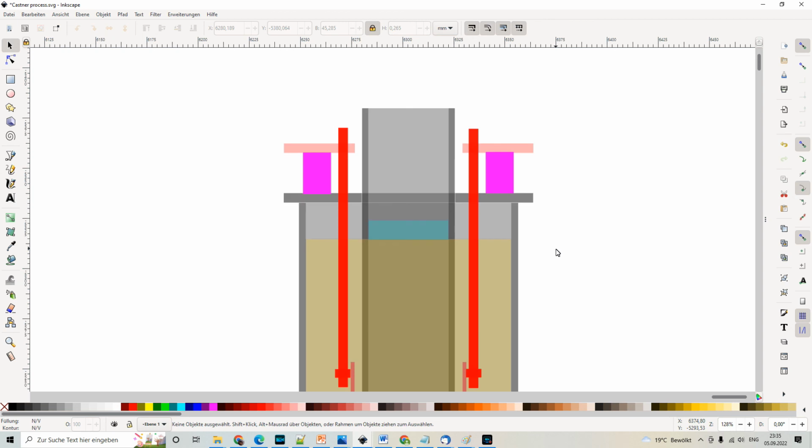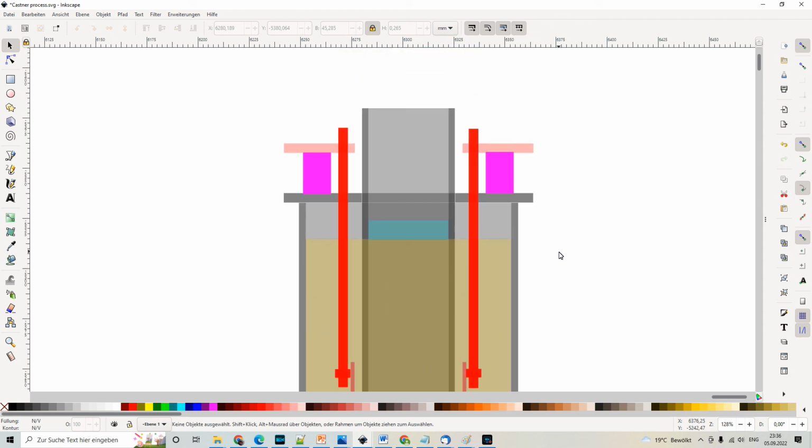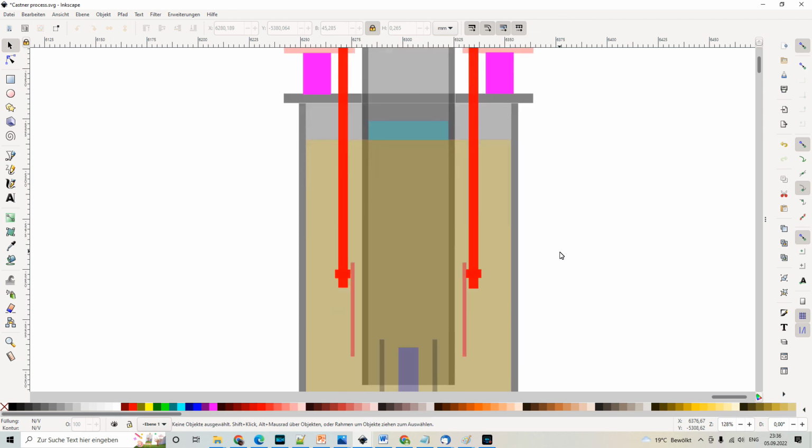Additionally, with a small cell, you're messing around with where I should put the thermocouple, how I should do that. And with a bigger cell, you simply have more space, also more space for adaptations. And yeah, in general, building stuff bigger is always a good idea to make it work.